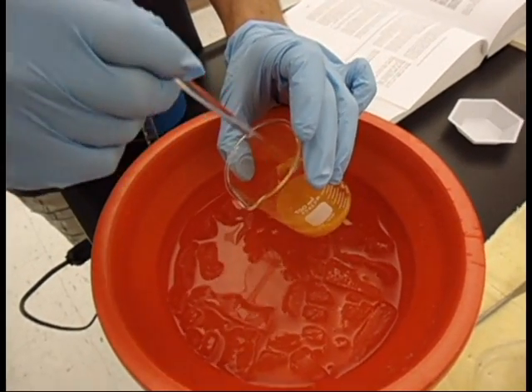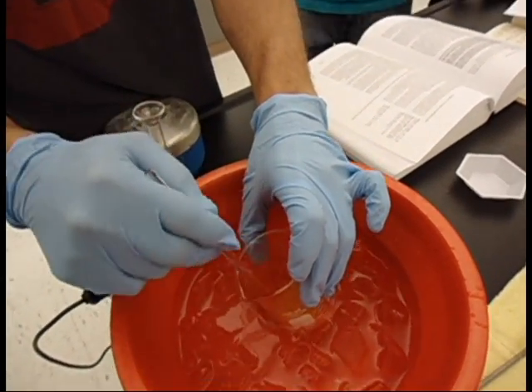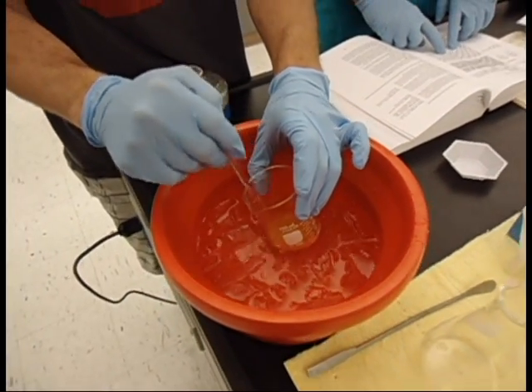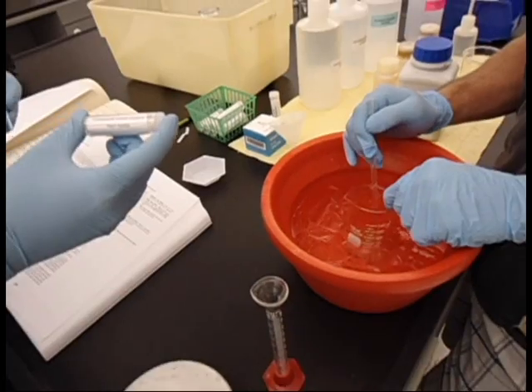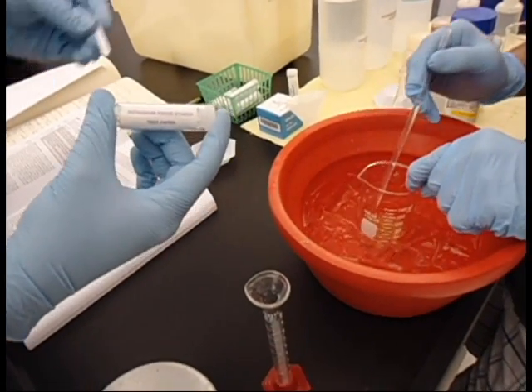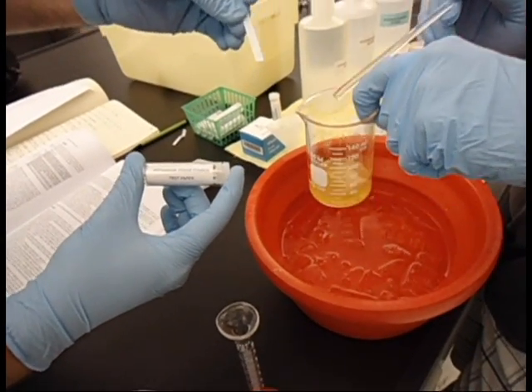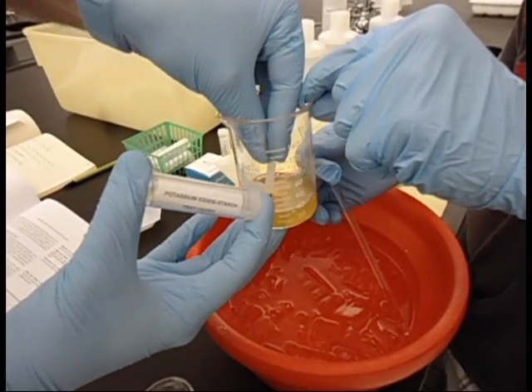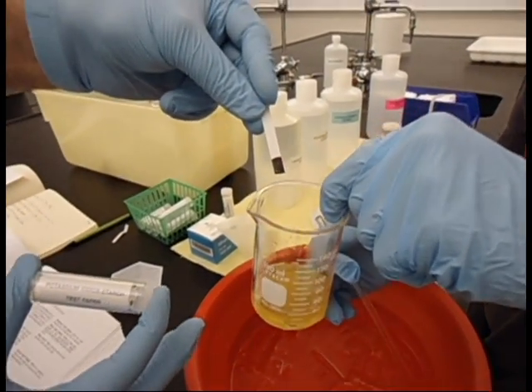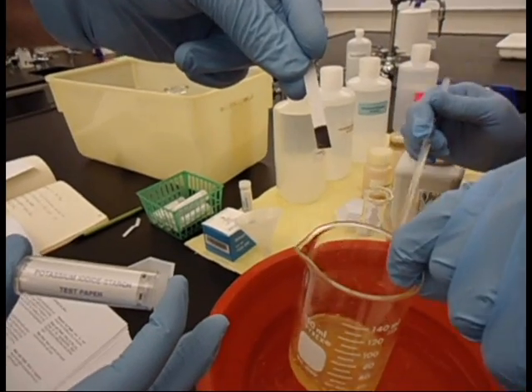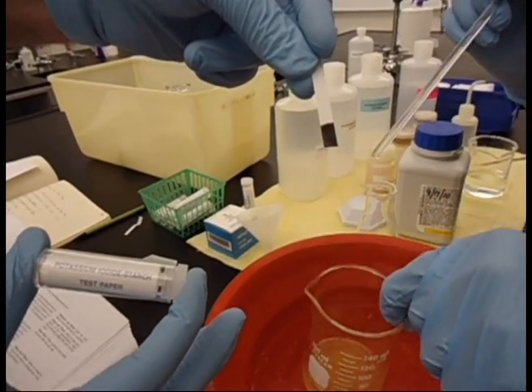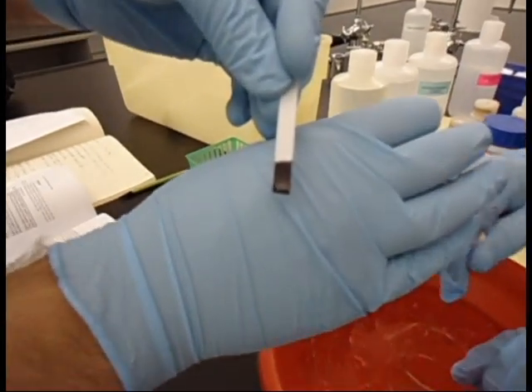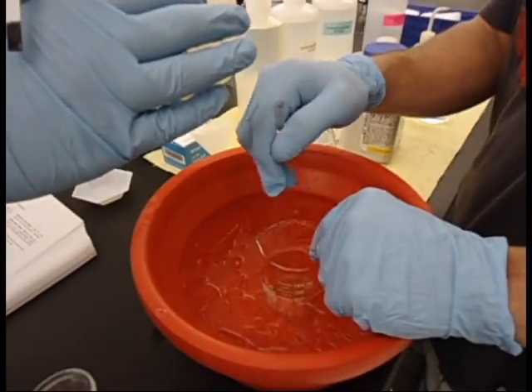Now that we added our sodium nitrite, we're going to test it to see if we added enough with the starch paper. We're looking for a blue-black color, and we have a black color that's slightly blue. That looks like we got enough sodium nitrite in there to be good.